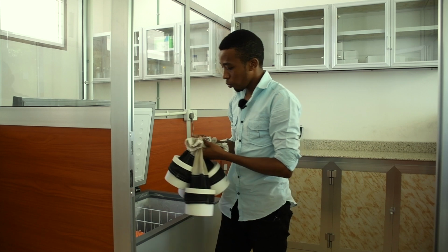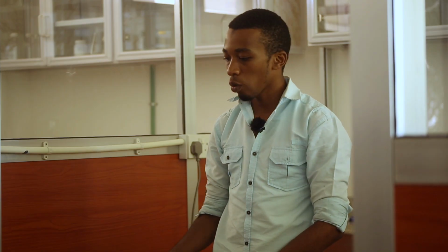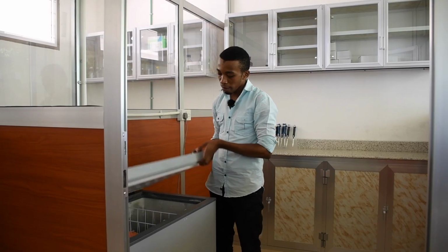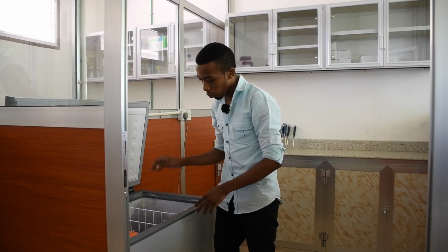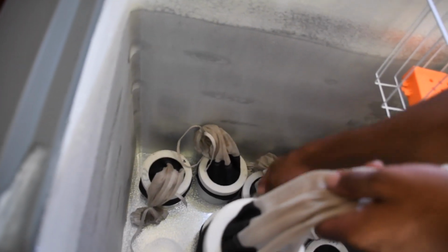So once we've transported the mosquito samples from the field, we temporarily store them in the cool box. We try to cool down the mosquitoes so that they can hibernate or fall asleep. And then we retrieve the samples from the cool box. We have different samples from different traps.